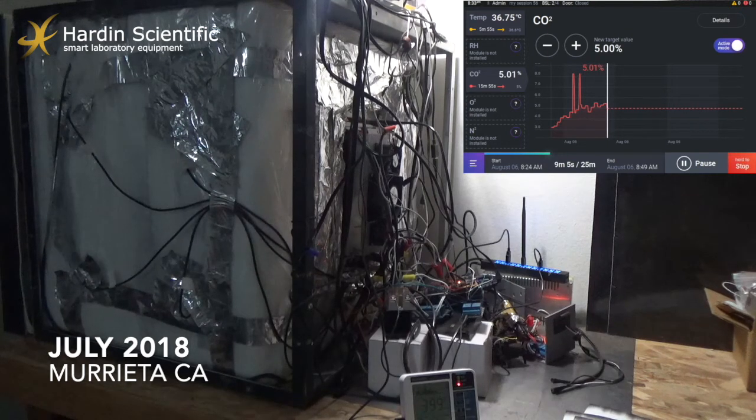But at this moment, we think this is the optimal configuration of the CO2 module, the gas adding and ventilation process for this module. So 501, it's pretty close, it's pretty good, it's the target.